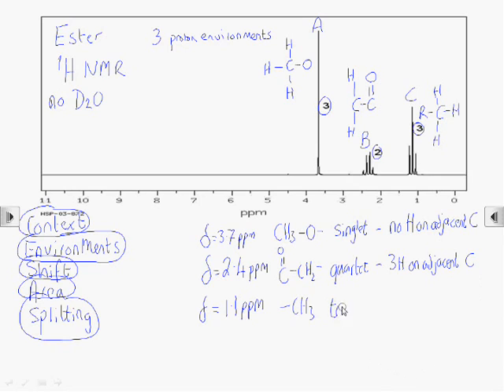And that's confirmed because environment C is a triplet which tells us there's two hydrogens on the adjacent carbon. And that signature of a triplet and a quartet linked to each other is very characteristic of an ethyl group.